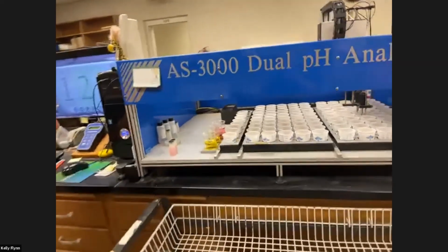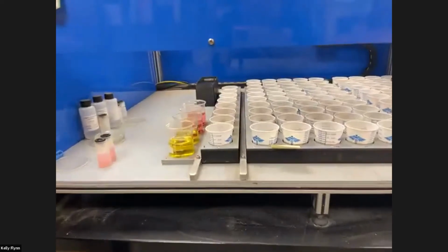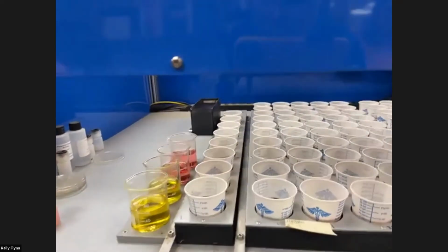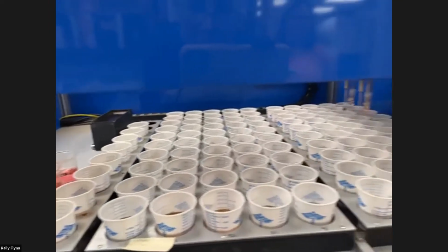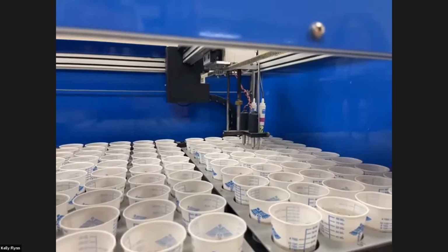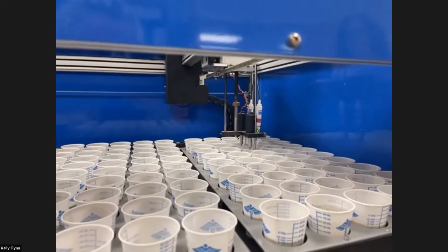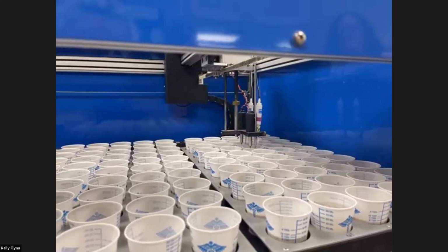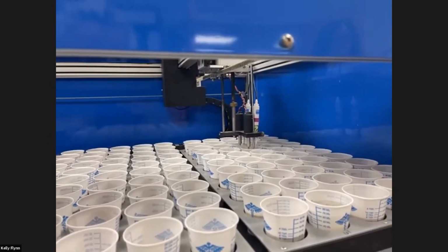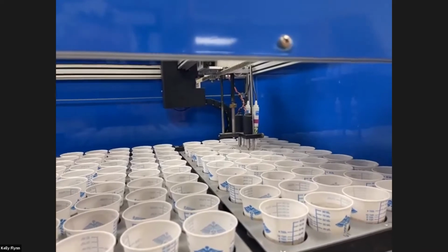So this is the dual pH analyzer. This is our pH 7, pH 4, and in the back there's a wash container that's just distilled water. And as you can see right now, it moves from sample to sample, and it stirs. It has an automatic stir, and then it waits approximately 10 to 15 seconds or so after the slurry is stirred, and then it'll take a reading.